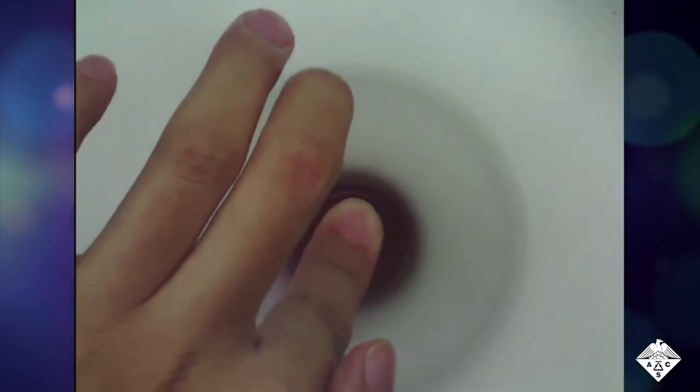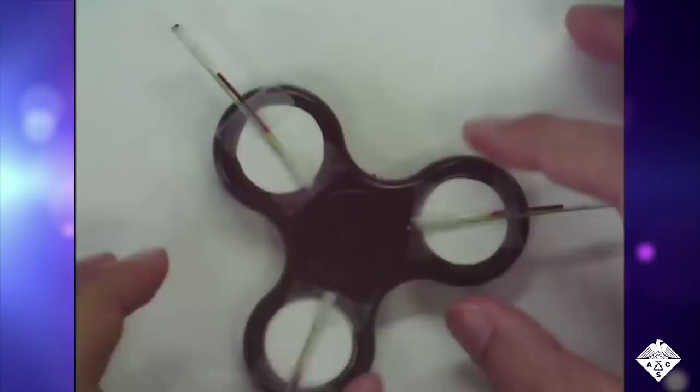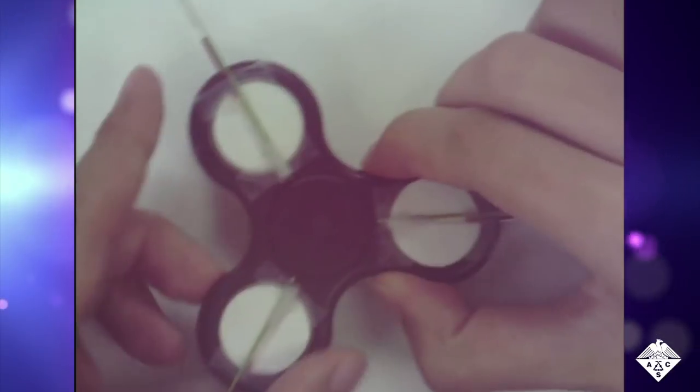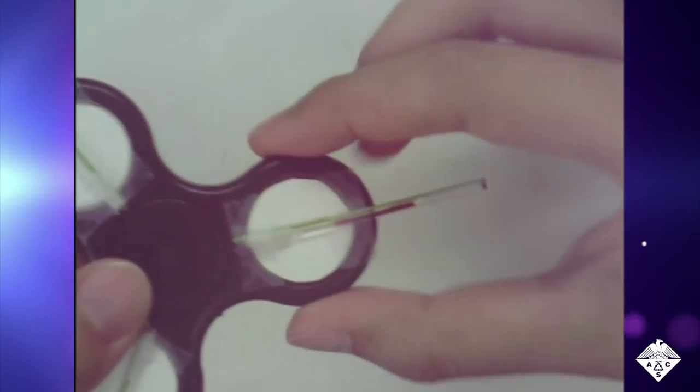They found that by flicking the spinner with a finger three to five times, allowing it to come to a natural stop in between flicks, they could separate about 30% of the plasma with 99% purity. The separation required only four to seven minutes.